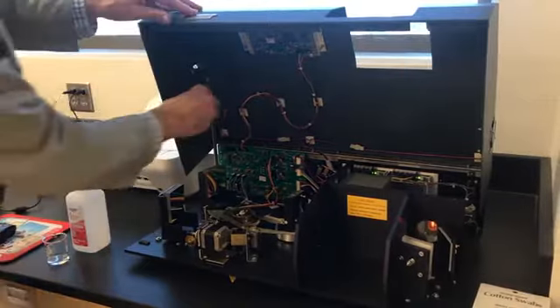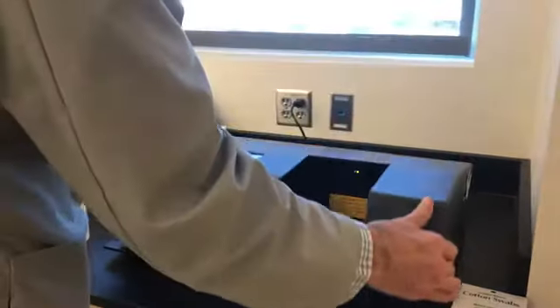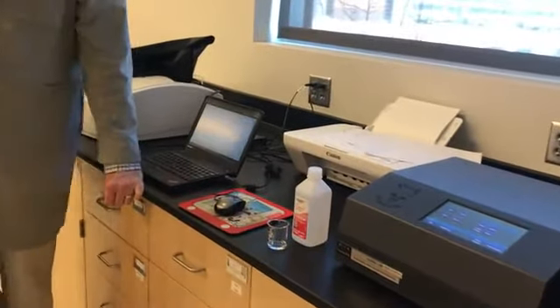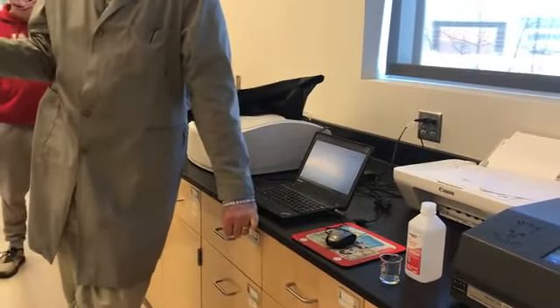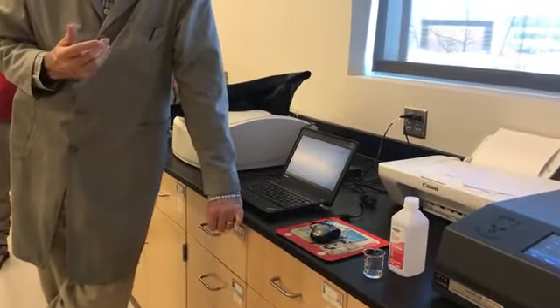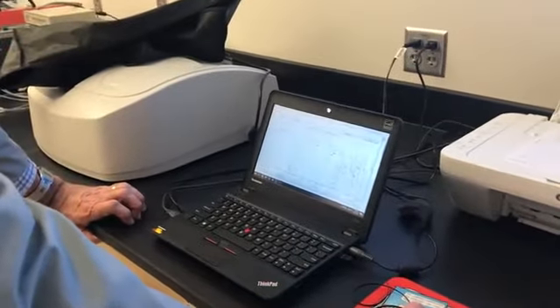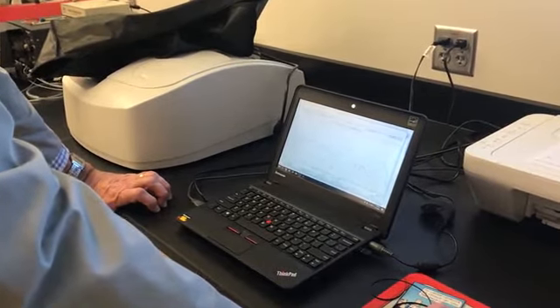The first thing we do when we get ready to collect the spectrum, just like we did in ultraviolet or visible spectroscopy, is run a blank or a background spectrum. In infrared, we're just going to run it against the air. So we're not going to use a solvent, we're just going to collect the background spectrum of the air. Everything is controlled over here through the laptop computer. So we're going to do our reference or background scan.